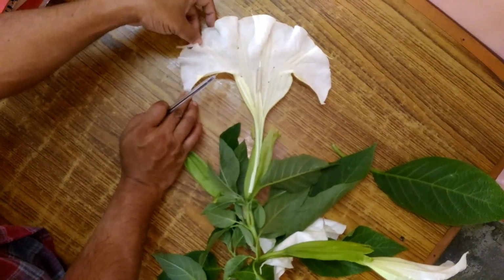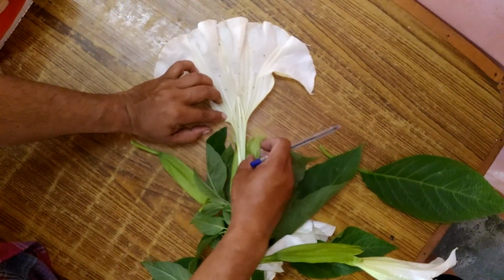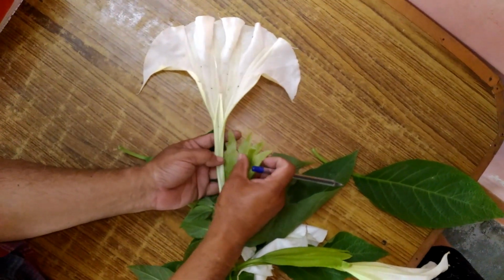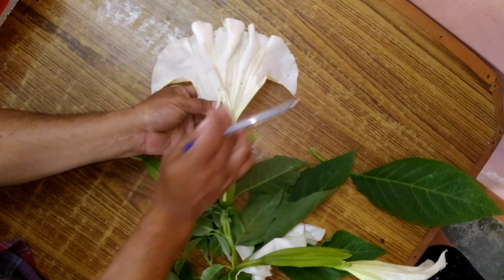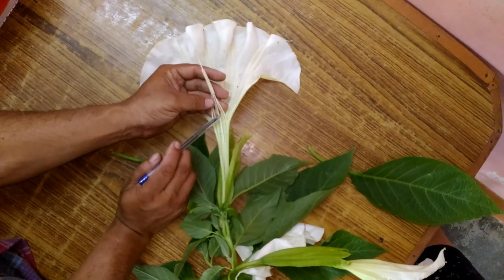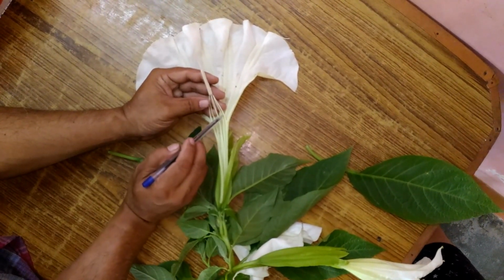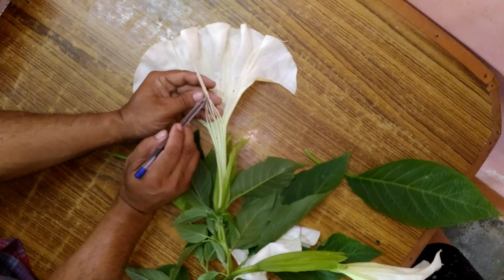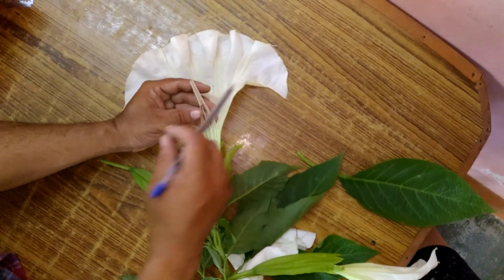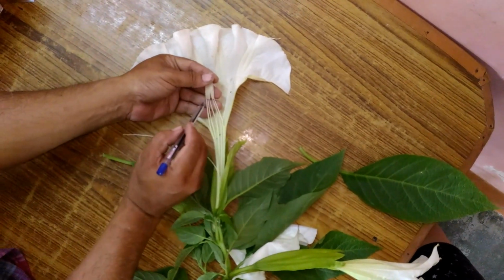This one is the corolla tube and these are the sepals and these are the stamens. 5 epipetalar stamens are observed, which are adnate near the base of the corolla tube, and these are the anthers, which are linear and included. Okay, these are the filaments.